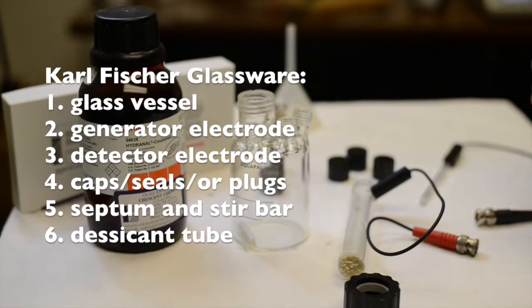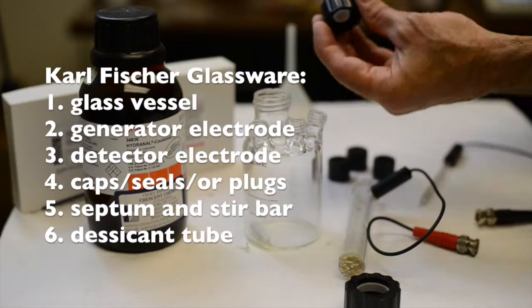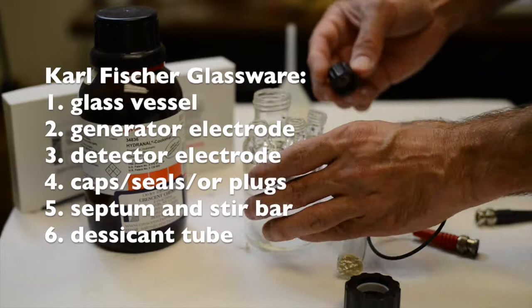Carl Fischer glassware is composed of a glass vessel for holding the reagents and the sample and generally has three to four ports on top for holding the detector electrode, the generator electrode, and for also introducing more reagents and injecting the sample.